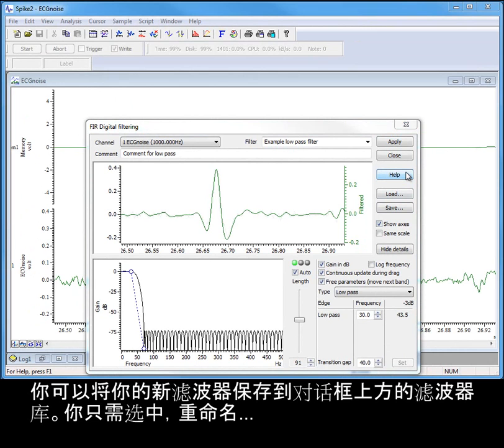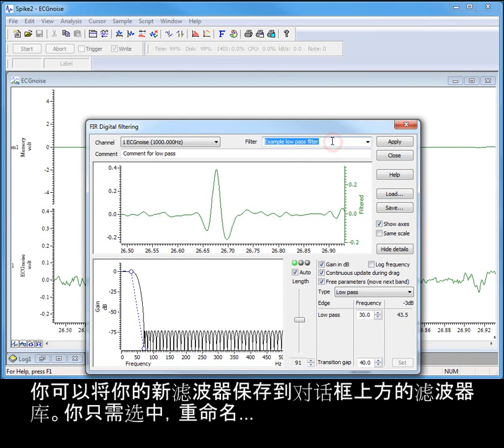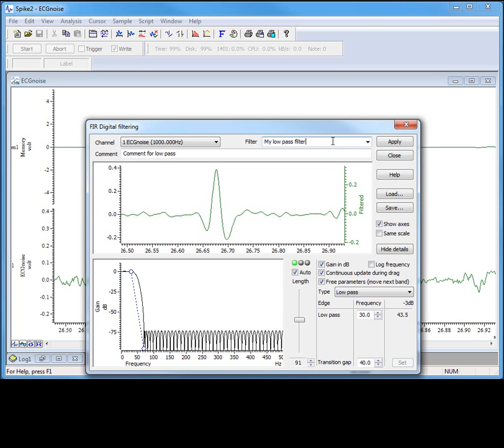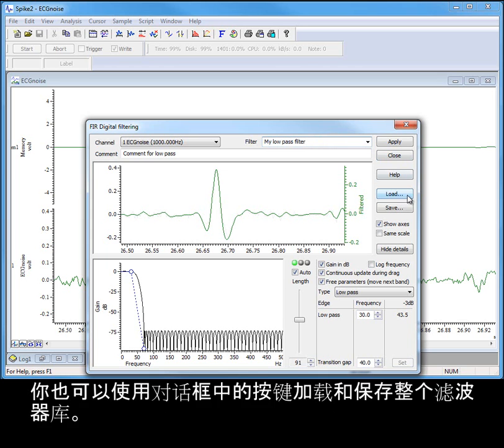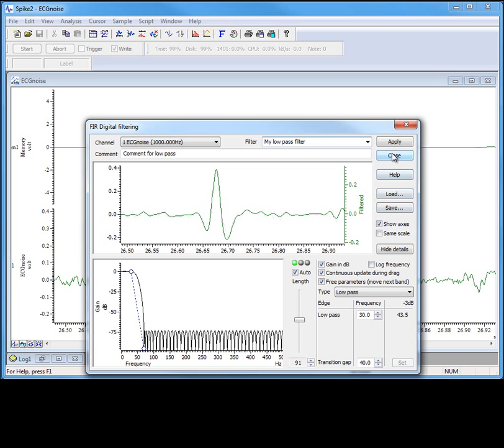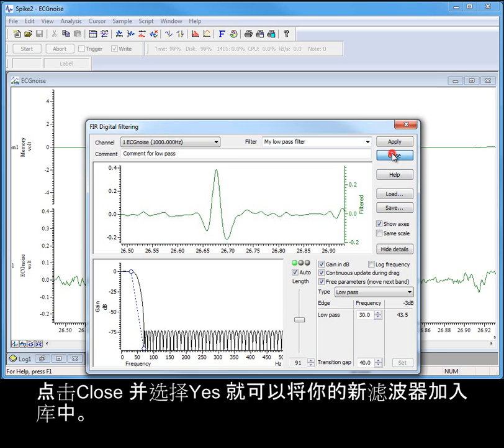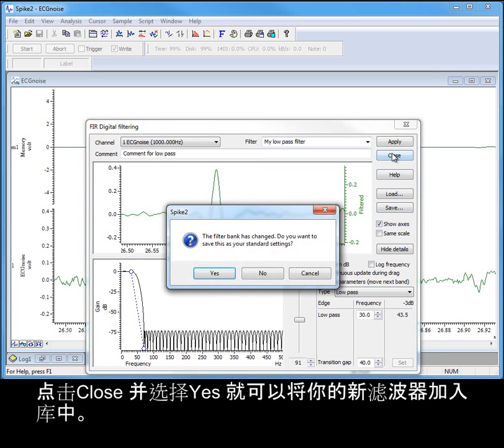You can save your new filter back to the filter bank in the top of the dialog. Simply rename the current selection. And when we close the filter dialog, we will be given the option of adding our newly created filter to the current space in the filter bank. You can also load and save whole filter banks using the buttons in the dialog. Click close and then select yes to add your new filter to the bank.